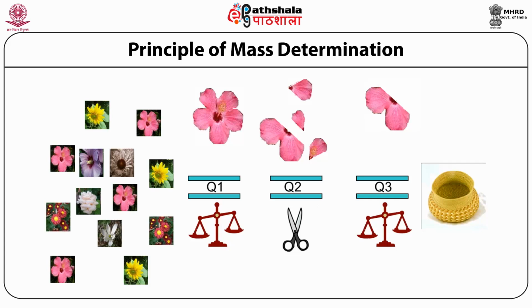The second isolation happens in the chromatographic column. The third isolation happens in quadrupole 1, and in quadrupole 3 it picks up the fragment which is very unique for that particular compound. Therefore, this technique is considered the gold standard for the analysis of a particular compound.